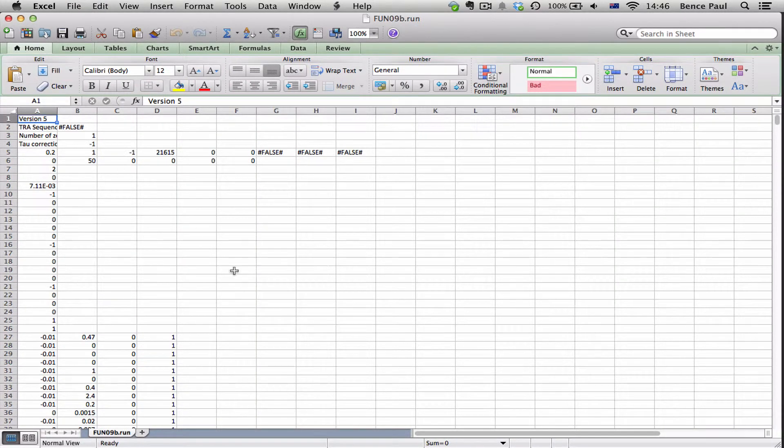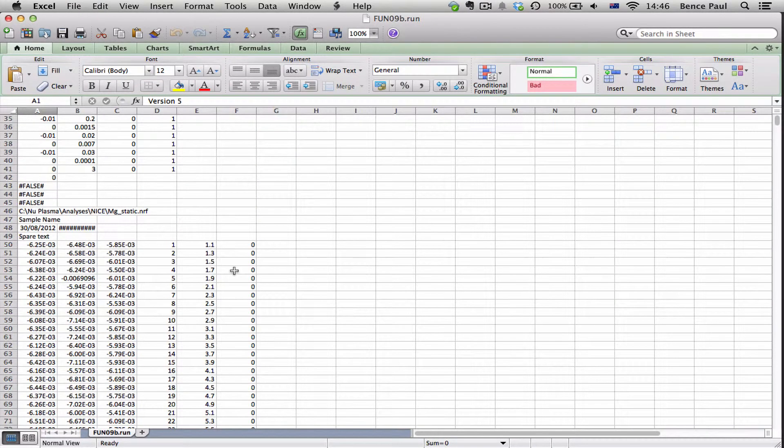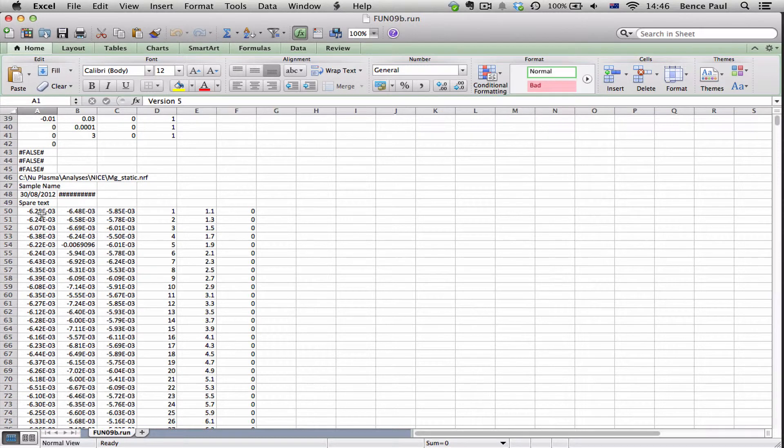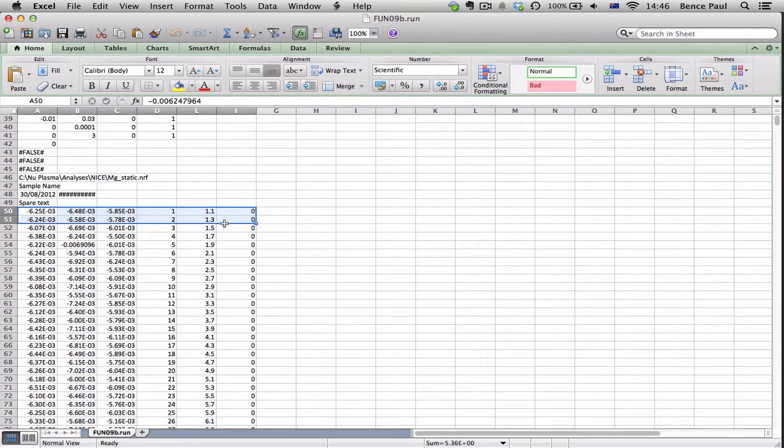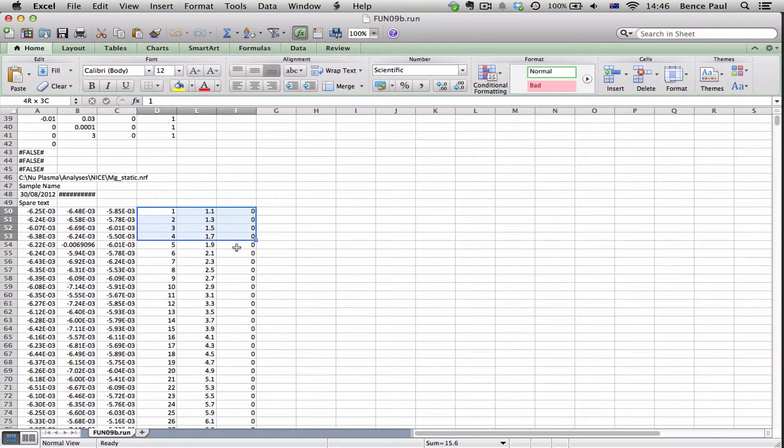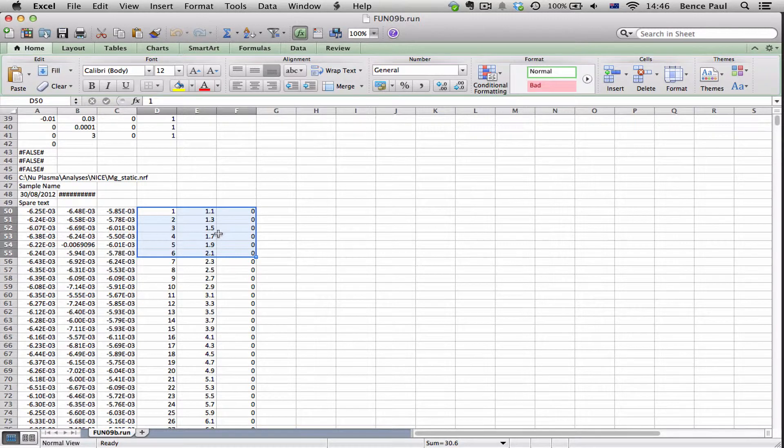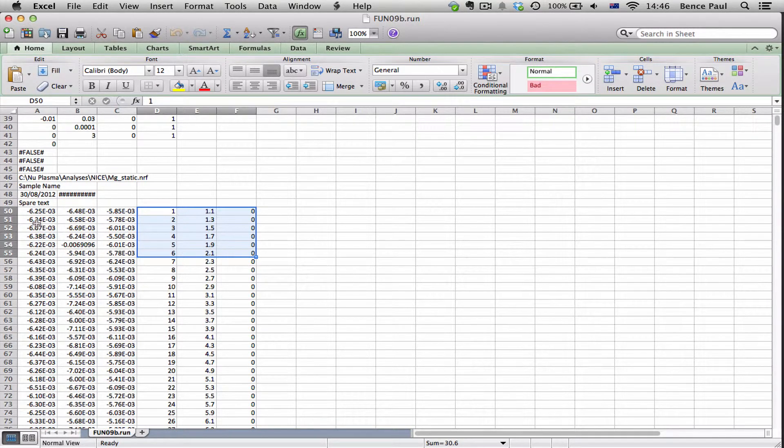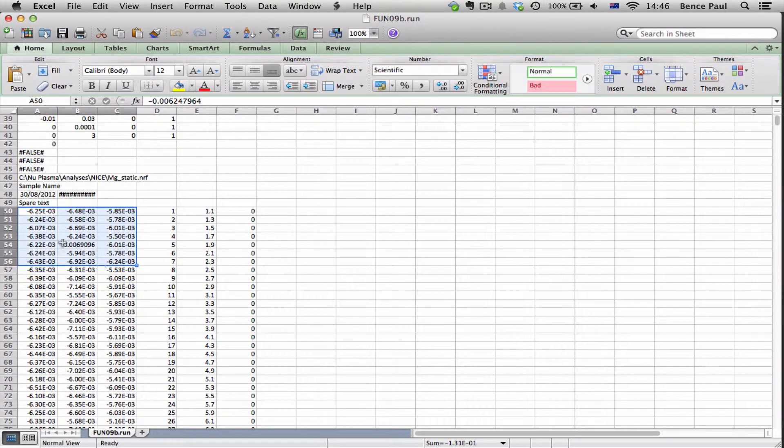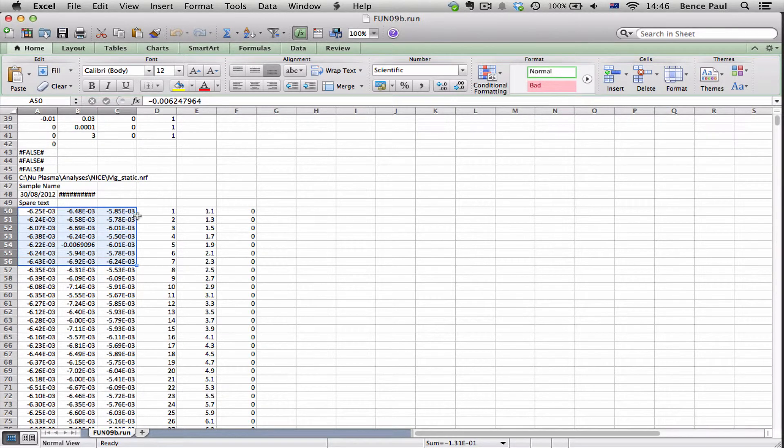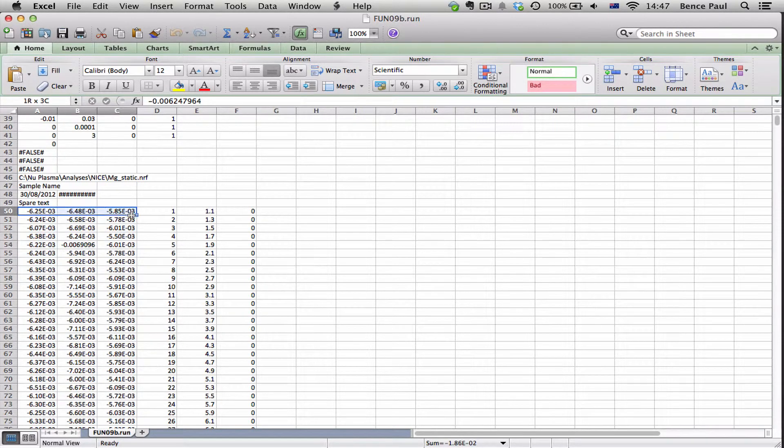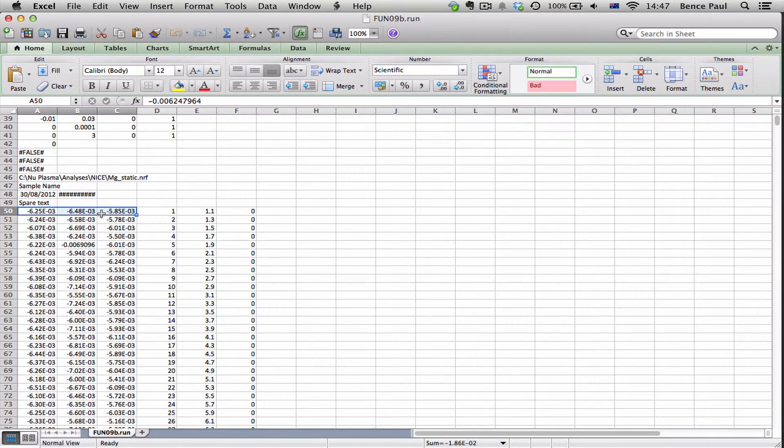And we can see there's a bunch of header information here but then we get down to our data. These last three columns are just there in every file but these are the ones that actually contain our data. And you should know from when you've measured it what these are called.